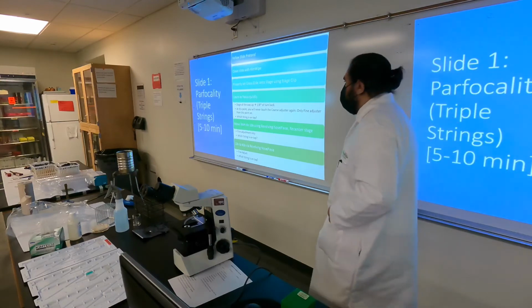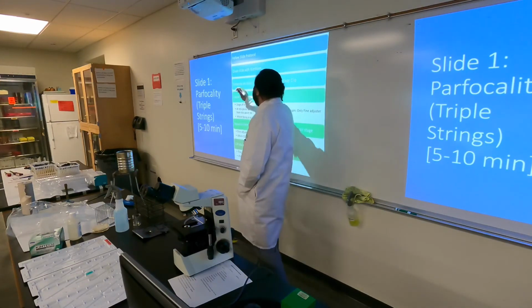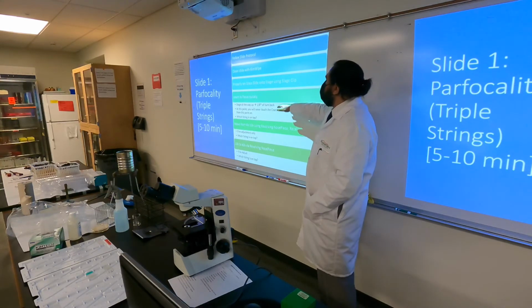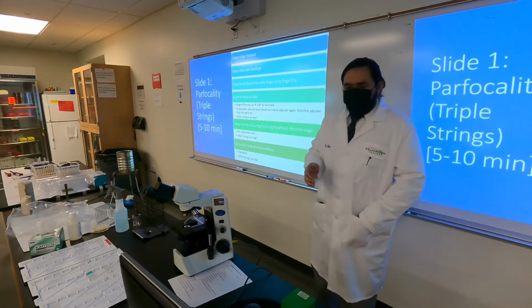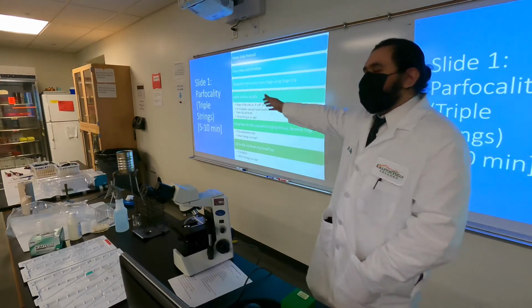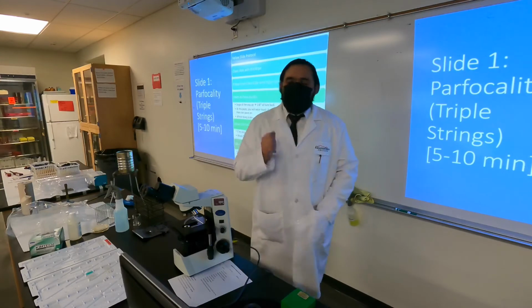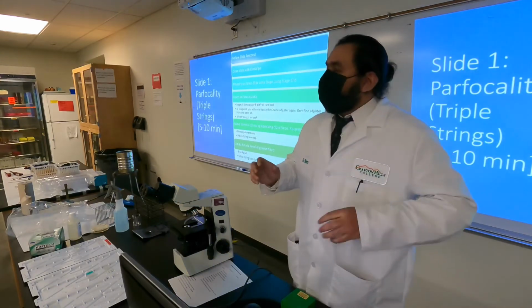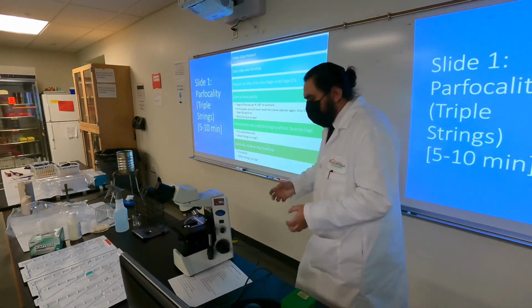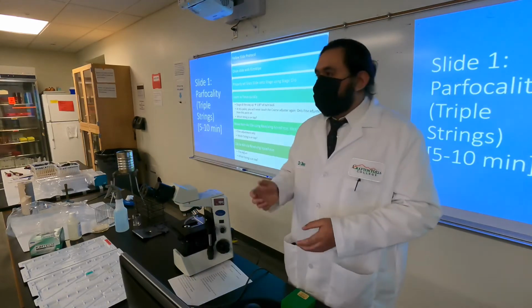So, what are we doing in parfocality? Well, we're going to do the same protocol that we use always. We clean our slides, we get set correctly with the stage clip, and the idea is we want to make sure we learn how to focus efficiently. And so right now we want to be able to find it based on your training. That means you've had great training in your previous classes and know exactly how to use the scope perfectly, right? Well done. So now we're going to raise our stages with the coarse knob adjuster, the fat, chunky adjusters that we have over here, until we're able to observe our first image.